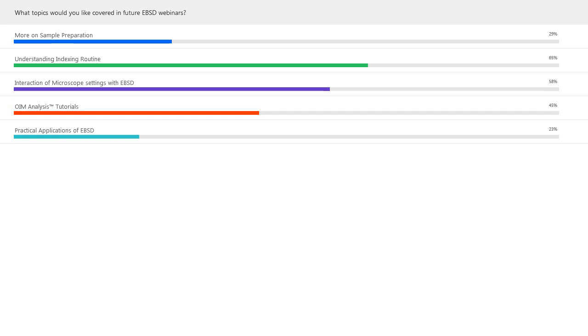And then a question about NPAR before or after cleanup. Essentially, NPAR should always be done before cleanup, and the reason is because I am changing my indexing. Cleanup routines and NPAR are fundamentally different, and the fundamental difference is that the cleanup routines use the data after it's indexed, while NPAR is reindexing it.